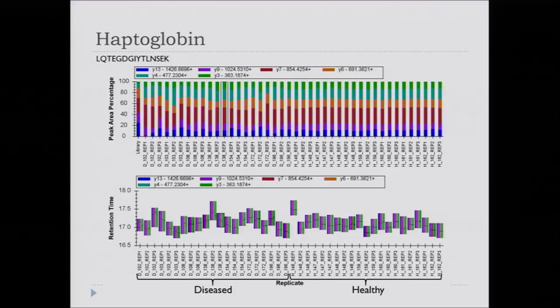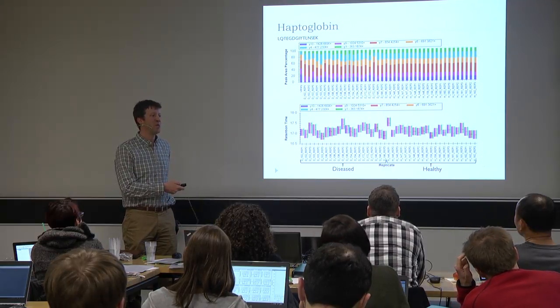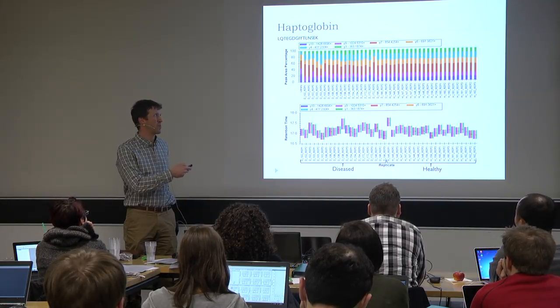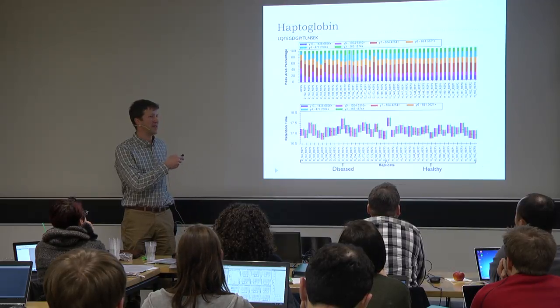We just went out and saw what's in PeptideAtlas and what's in the Global Proteome Machine, and those are the spectra we have. I wouldn't put too much stock in the fact that they don't match exactly. To me this is a close enough match to say there's a pretty good likelihood that these measurements are the same as that measurement.